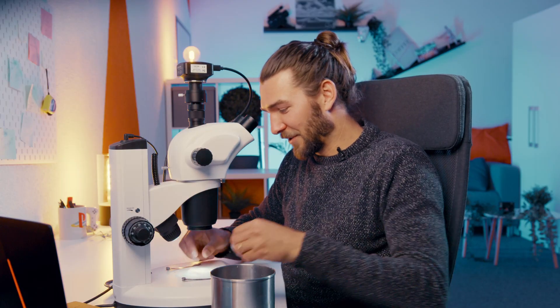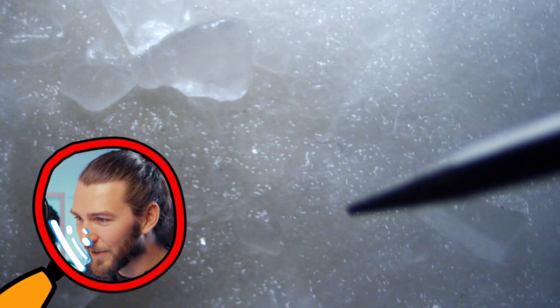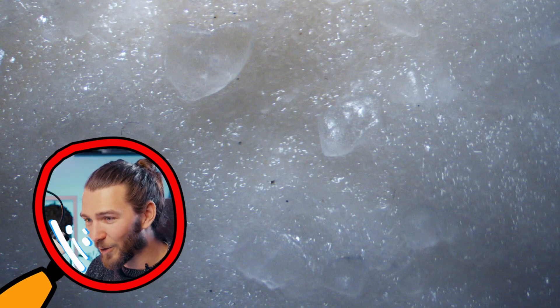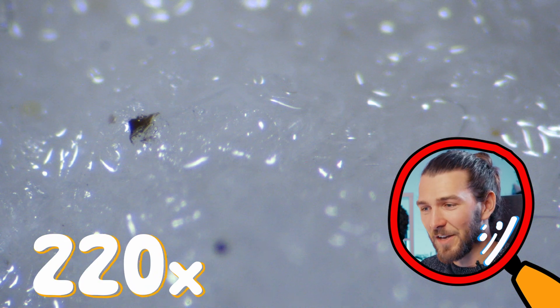So let's check it out under the microscope. We've got our filter here and we can see the salt crystals pretty clearly. Moving around, you can see one particle here already. There are also little black spots. Let's just zoom in — now you can see this black spot. It could be algae, actually. This is what they told us in the course: sometimes this residue of algae is floating around in the ocean and is also scooped up and evaporated on the salt fields.